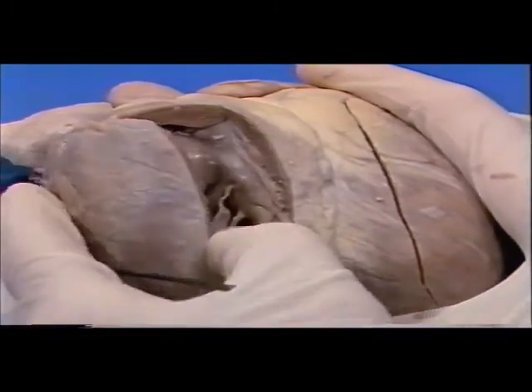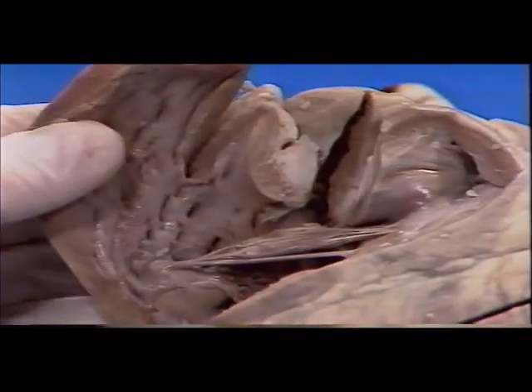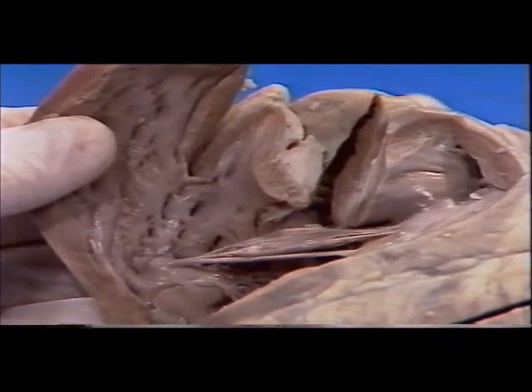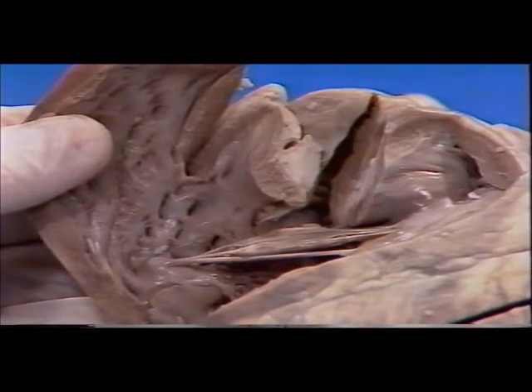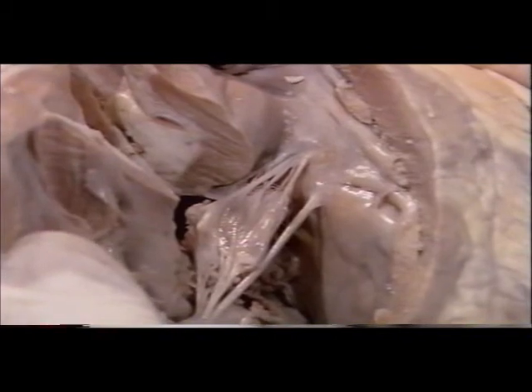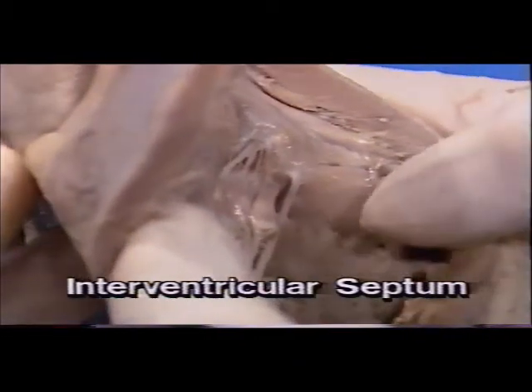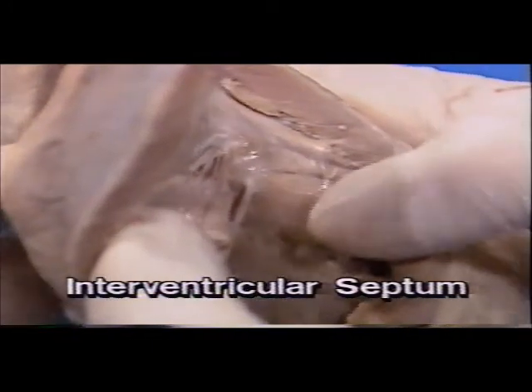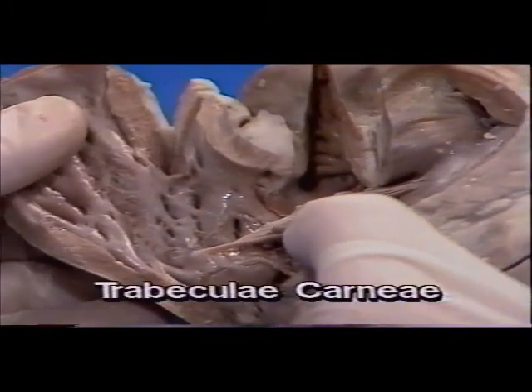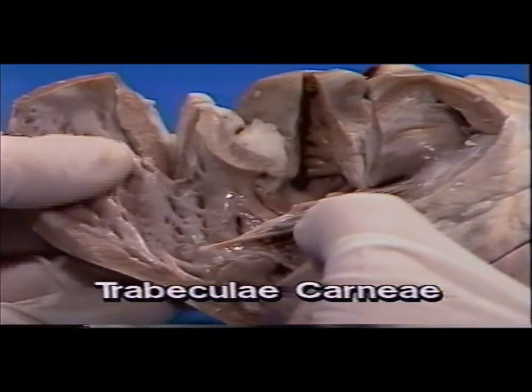The word ventricle comes from the Latin word meaning little belly. The ventricles are, in fact, little cavities, as you are now able to see. You also see that the two ventricles are separated by the interventricular septum. The interior of each ventricle has a characteristic texture created by the presence of trabeculae carneae. This term means fleshy beams.